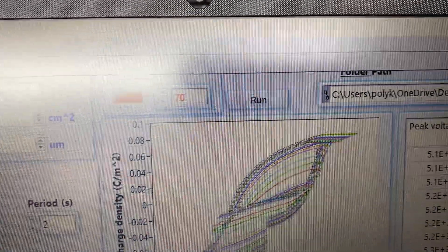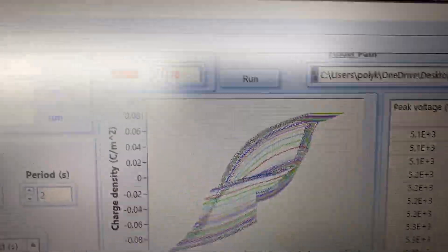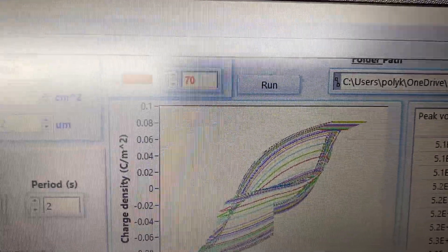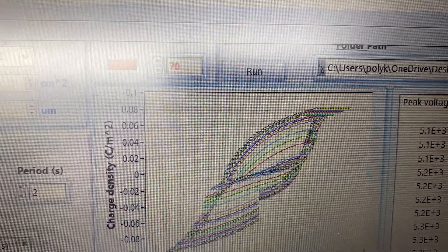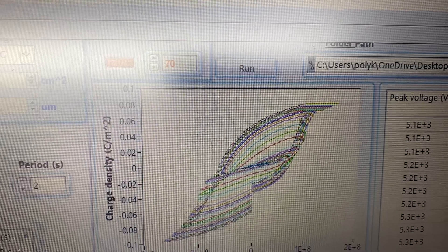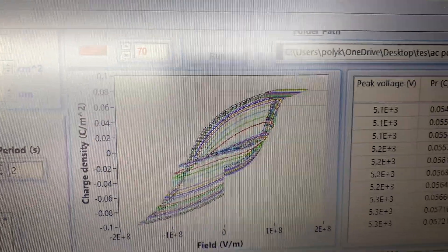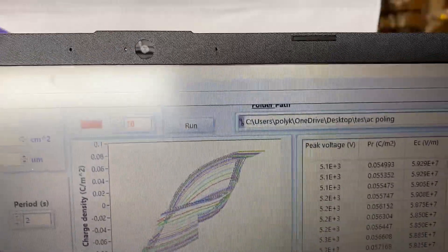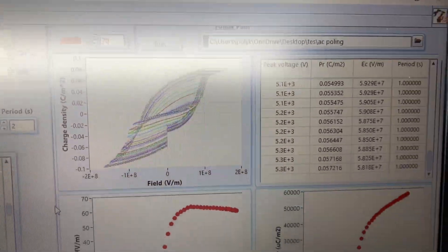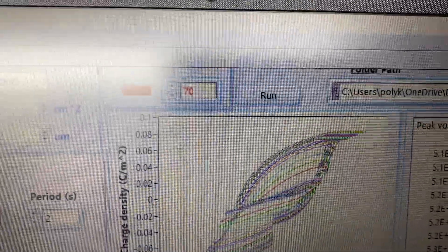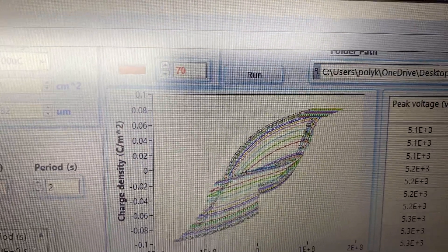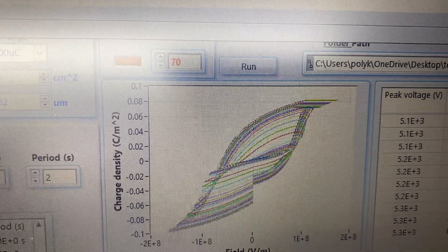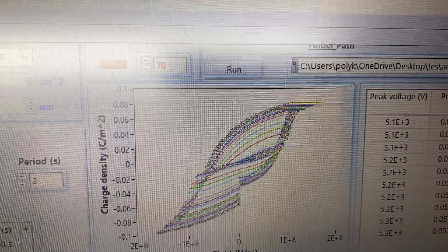You can even set a preset of PR rather than the polarization value because the polarization value is directly proportional to the piezo-d333 constant. So you can set this PR value. If the PR of your sample reaches this PR value, it will automatically stop.